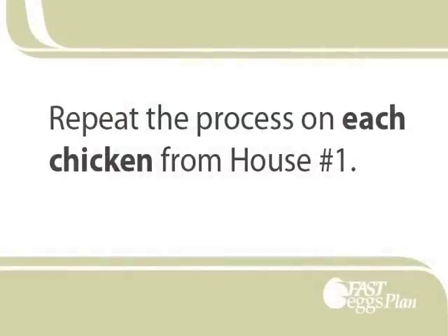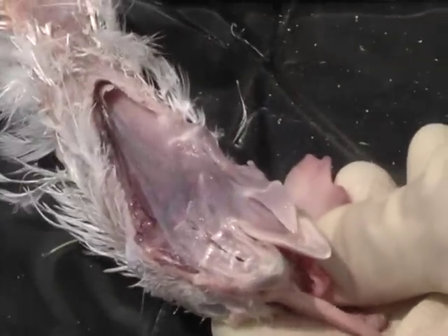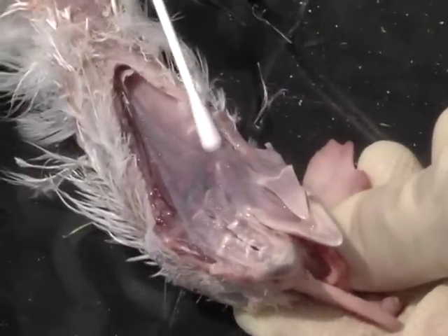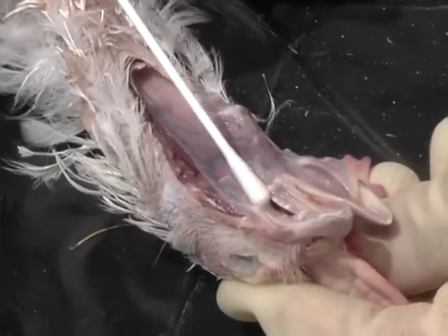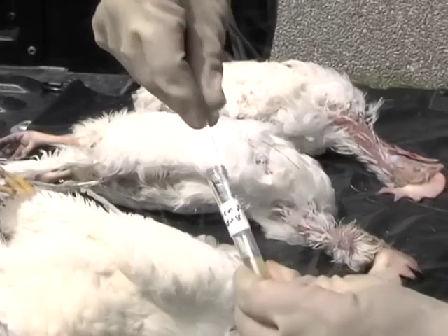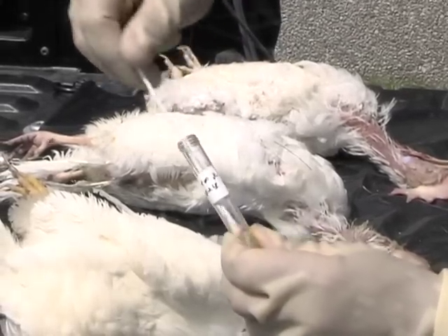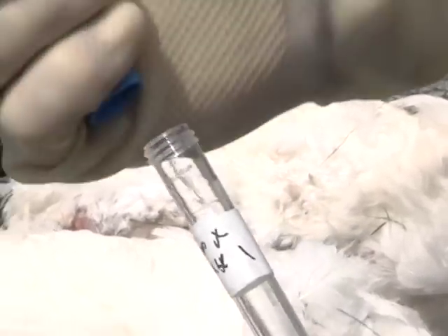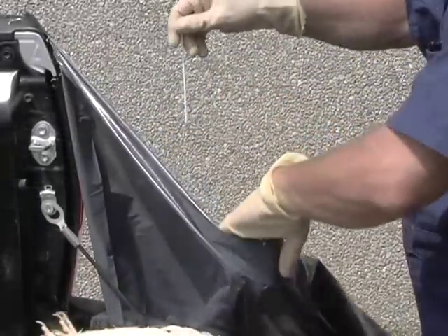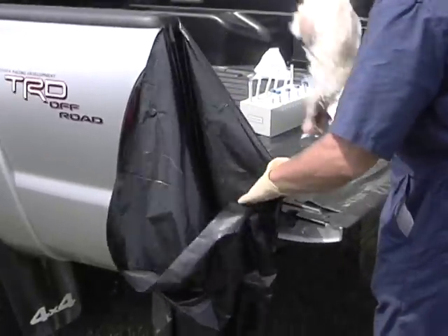Repeat the process with the second chicken. Use your left hand to pull the comb and the wattles together behind the head, exposing the glottis and the palatine cleft. Swab the glottis and palatine cleft, and place the swab in the same BHI broth tube — the tube for house number one. Swirl vigorously and squeeze out as much liquid from the swab as possible. Replace the lid. Discard the swab into the trash bag on the right, and discard the chicken into the trash bag on the left.